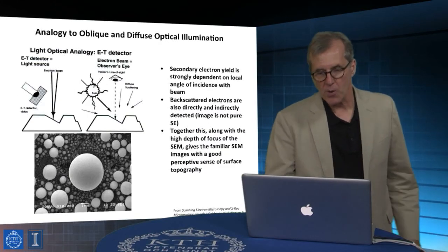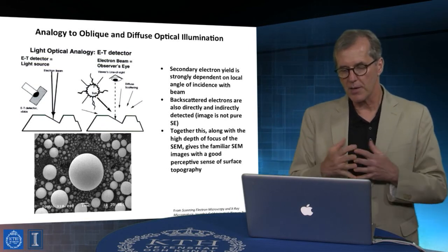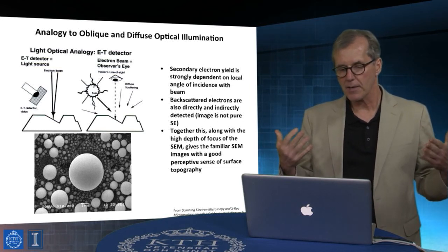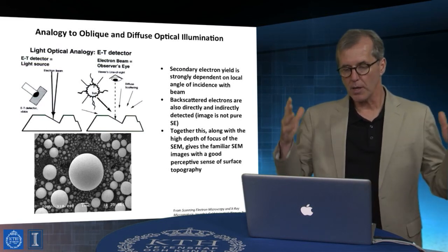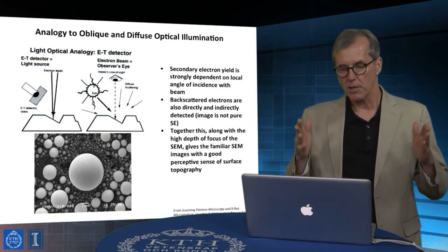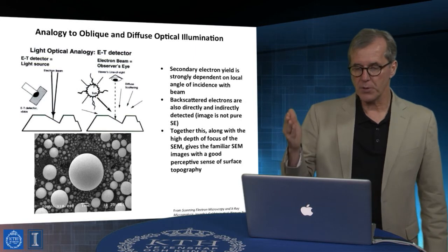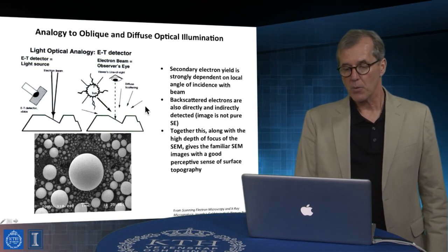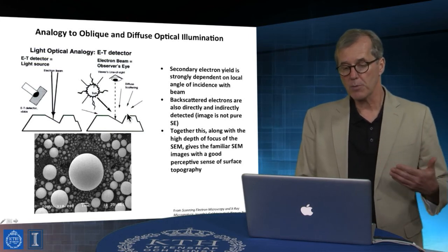So with that in mind, we can go ahead and ask, what is it that we can see, right? And the really beautiful part is that there are lots of nice analogies with light microscopy, but they do in fact break down. If we use white light, we have to ask, do we have high direct normal incidence lighting, or is it from a particular direction, and what's the field of view associated with our detector, which would typically be our eyes in this case. We also have to worry about not only diffuse light sources but also diffuse scattering blurring image profiles.